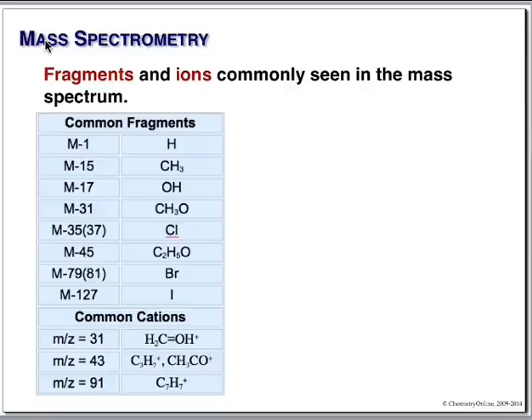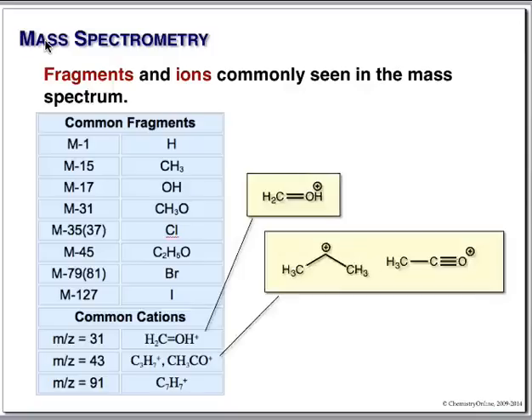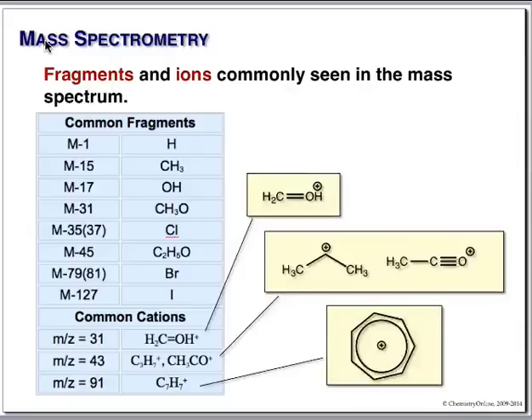43 either represents an isopropyl carbocation, a secondary carbocation, or the acylium ion. If you see a peak at 43, you're talking about these guys. Obviously, 91 is tropylium, or benzyl. Again, this is formaldehyde with a proton, the isopropyl carbocation, or the acylium ion, and finally, tropylium, telling you you had a benzyl.